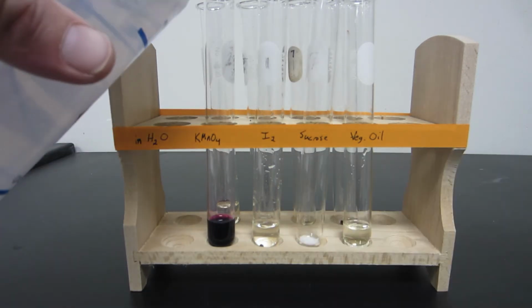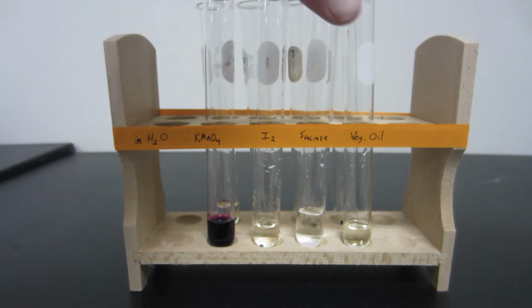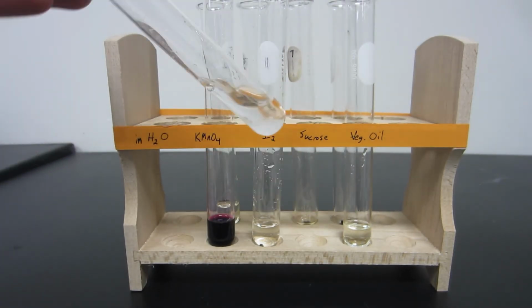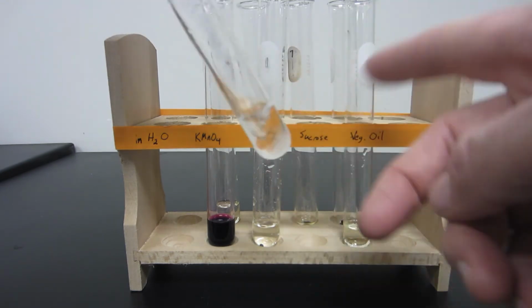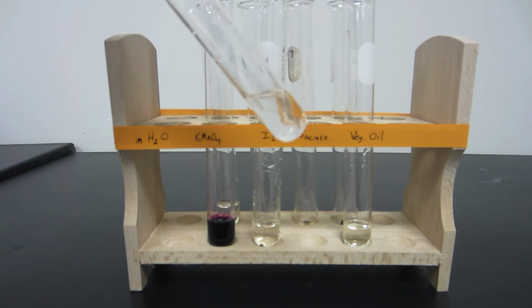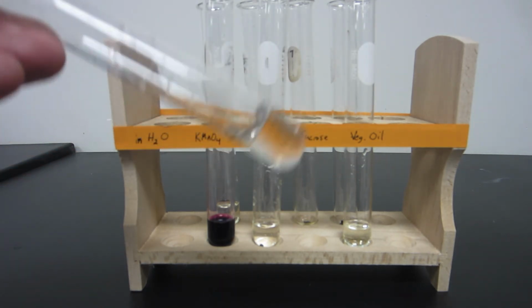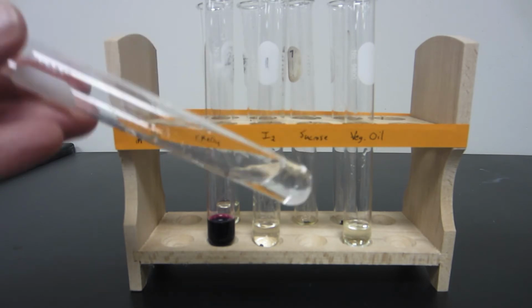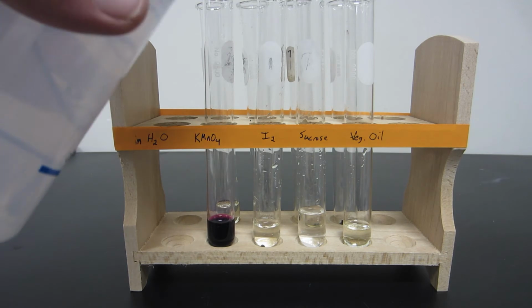And then just to finish off this part, we kind of know what table sugar does. I've added a pretty generous amount of the sugar, and we can see that some of it has definitely dissolved in the sample. If we wait a little bit longer, I think the rest of that would dissolve as well.